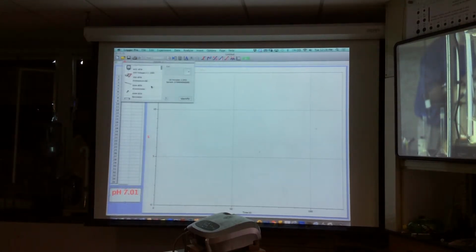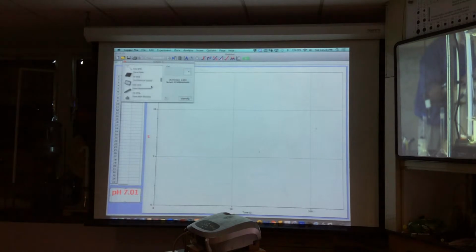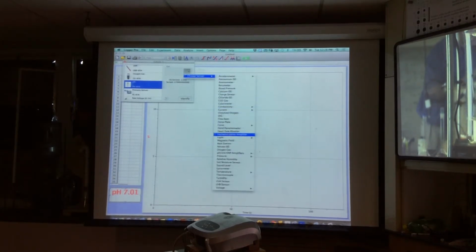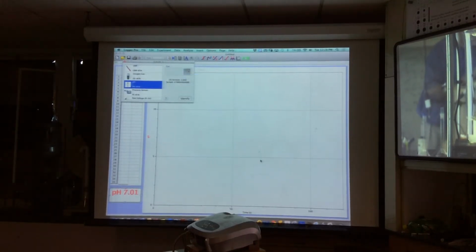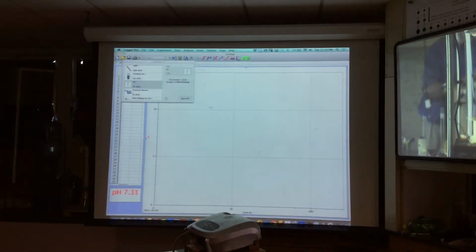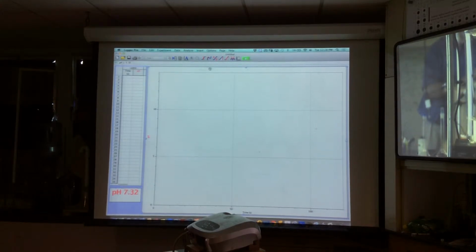Okay, let's go to pH probe. This just kills the class when you have to stop like this. That's all set up. Okay. Come on. Pressure, pH. Choose a sensor. pH. Okay, a lot. Okay. Yay. Maybe. We'll see. Okay, so there's my pH.